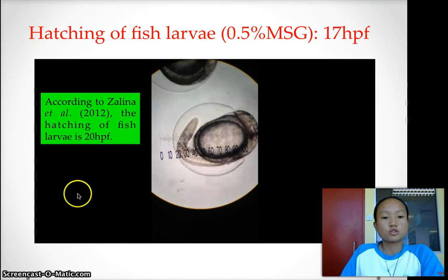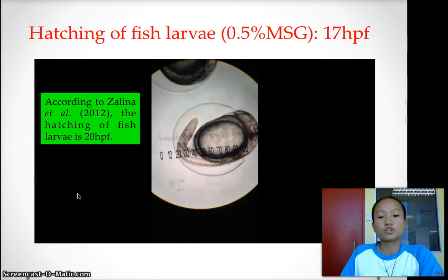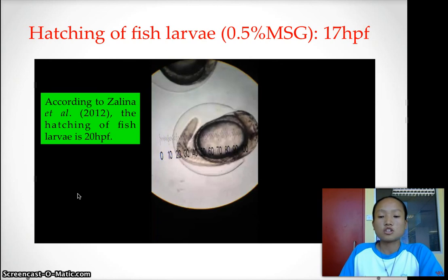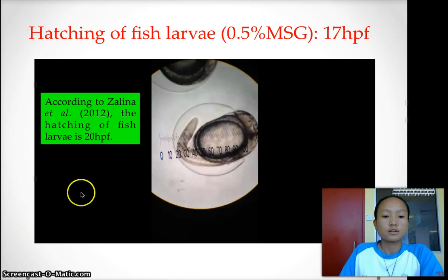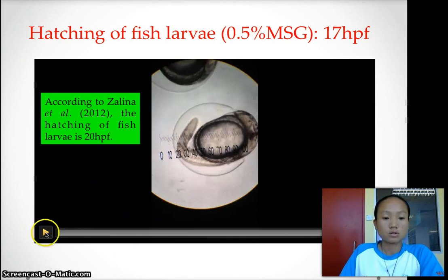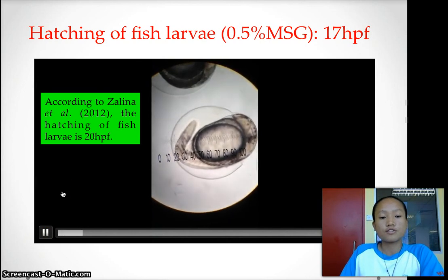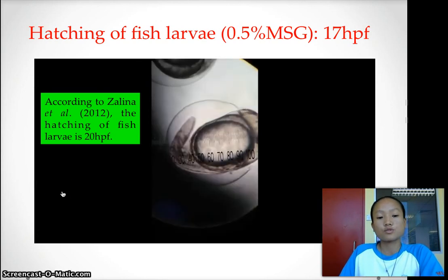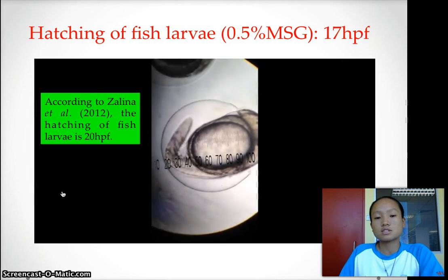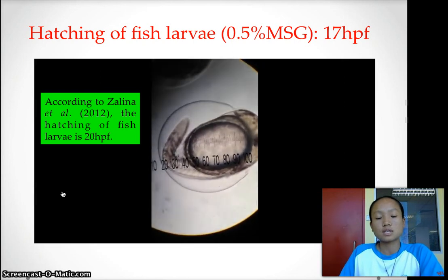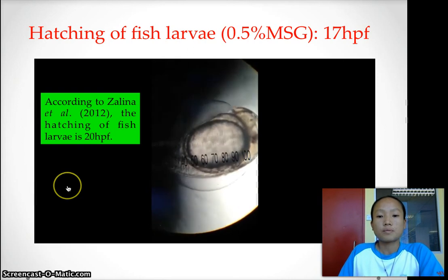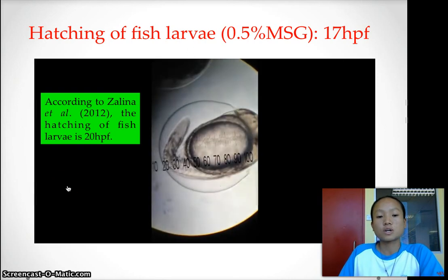Here we show a video of hatching for the fish larvae immersed in 0.5% MSG. The hatching occurs at 17 HPF, which is much earlier compared to the control. According to Zalina, the hatching of normal fish larvae is at 20 HPF — so our control is roughly consistent with Zalina's result, but MSG hatching was much earlier.